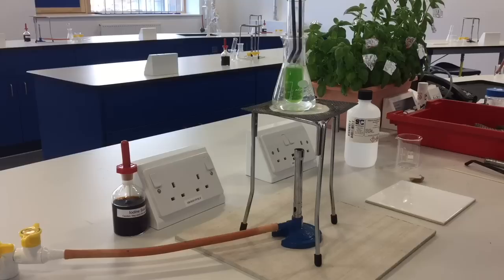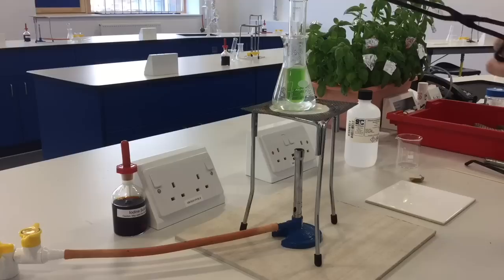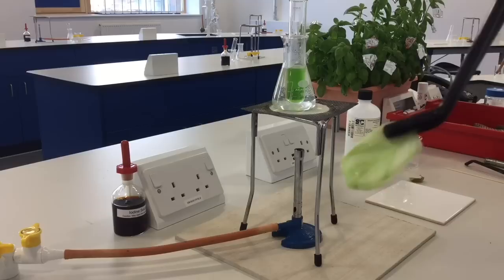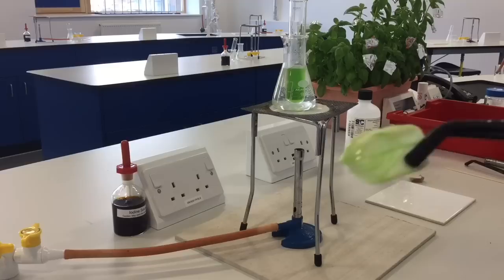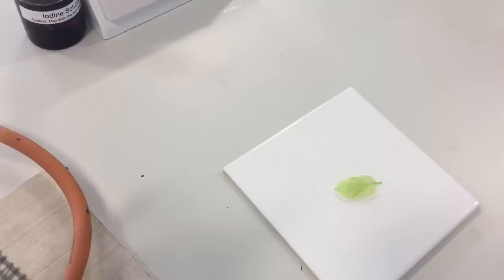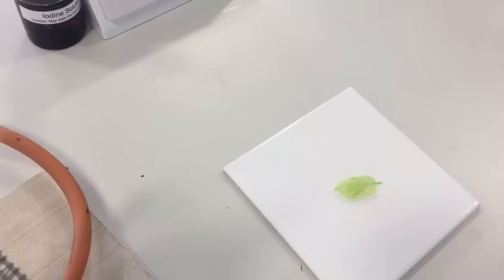Out comes our leaf, and as we can see, pretty much all of the green pigment has gone from it. Now it's a very white or colorless leaf we've got, so we're going to test that with iodine for starch. We'll pop it onto our tile over here.